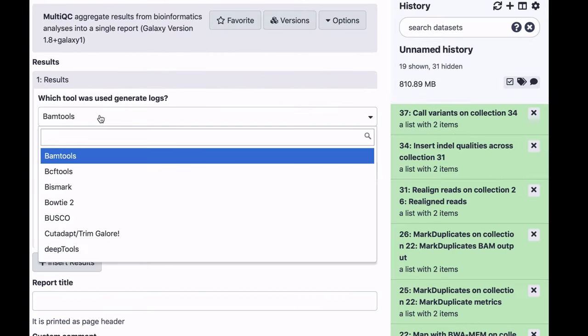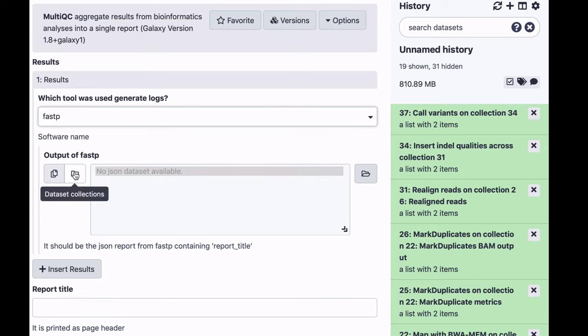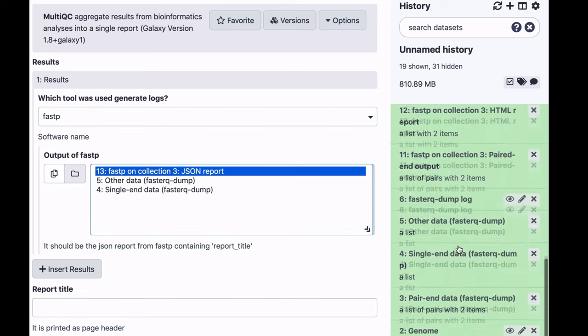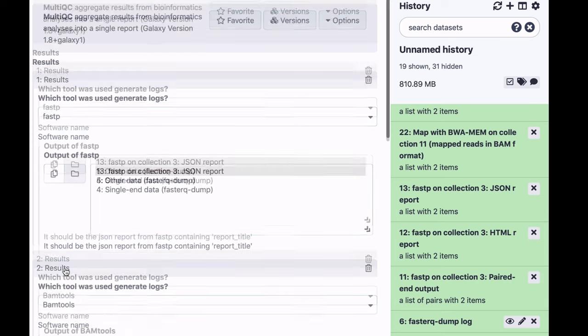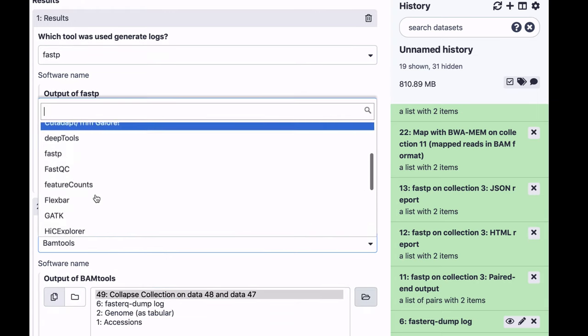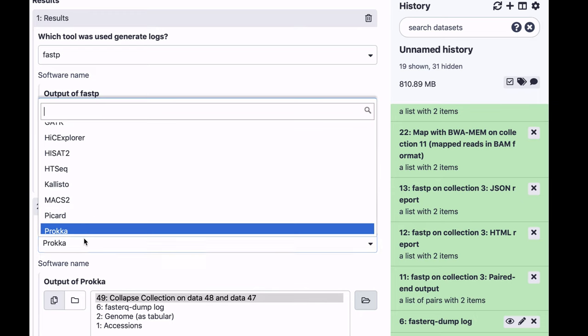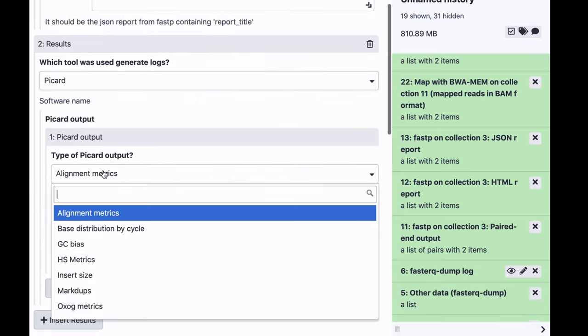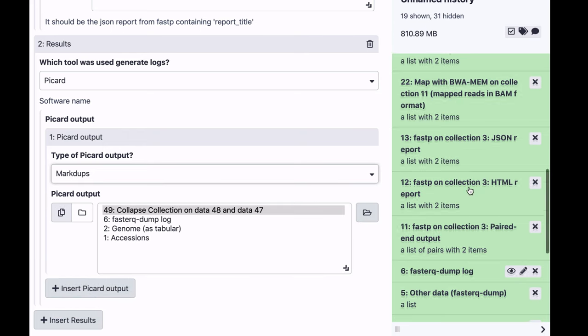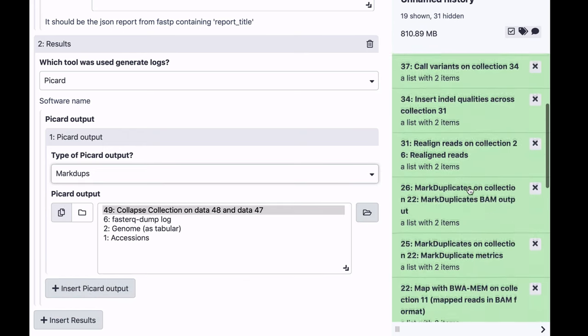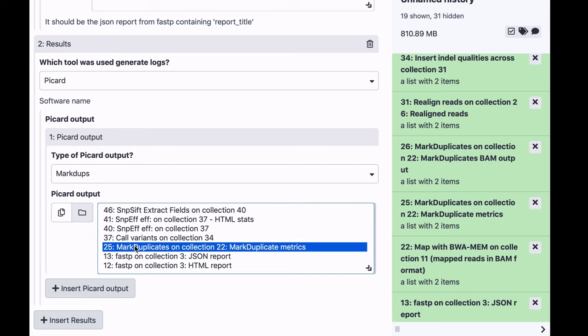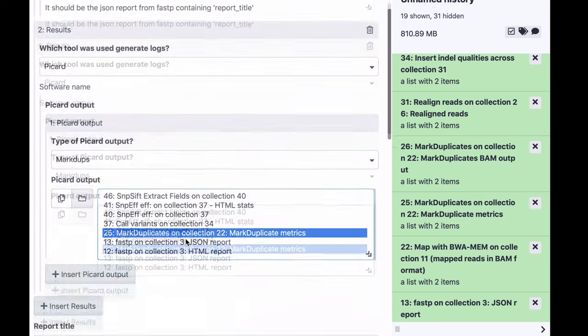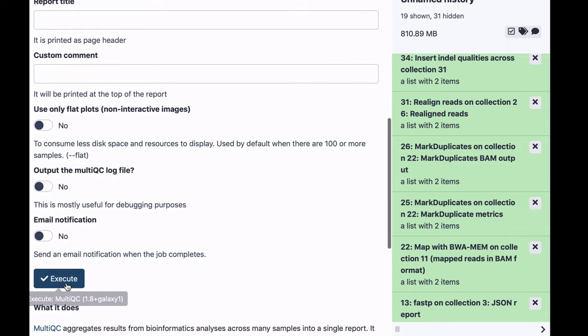So first, let's tell it about FastP. So this is our data set number 13, that's FastP in our data set collection, we're going to select that. And the second is the Picard tool, specifically marked duplicates. This is the other data set, so it's going to be collection number 25. Let's visualize these two summary statistics.